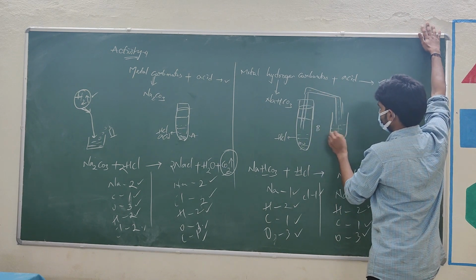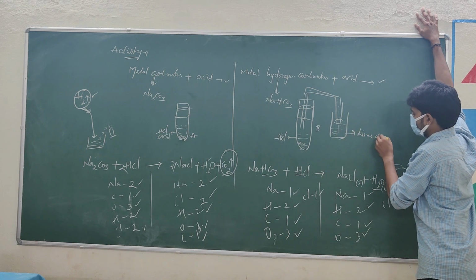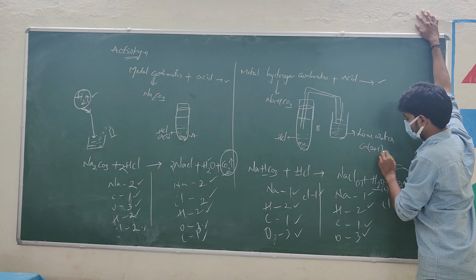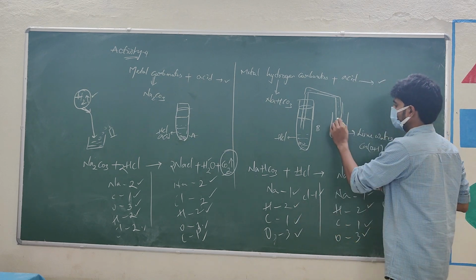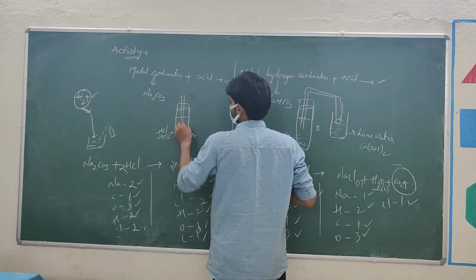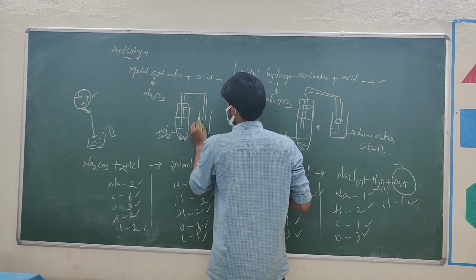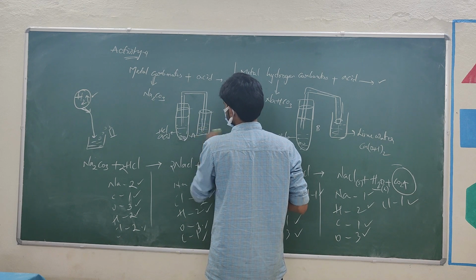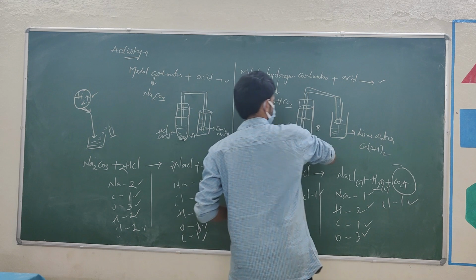So inside this we'll take one thing, that is nothing but lime water. What? Lime water, that is nothing but calcium hydroxide. Another name for calcium hydroxide is lime water. When the liberated gas gets immersed inside the test tube, okay, wonderful, when it is evolved inside the lime water, look at the equation here.